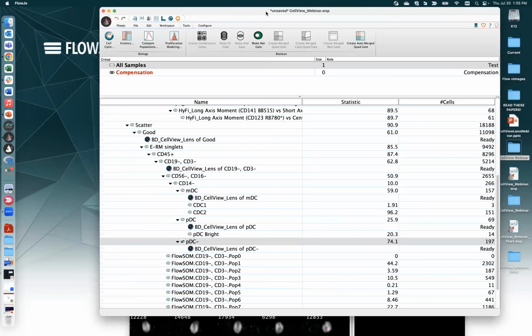All right, so that's the gist of how we anticipate the neural networks working. Again, they're working on Macs at the moment. We still have to figure out how to make the libraries work for PCs. We still have to figure out what the best neural networks are for this. We still have to benchmark which ones seem to work well in this data and which ones don't. But I just wanted to show you a little taste of where our thinking is going in terms of automating more of this process. Okay, we've got 5 minutes left. And so I would like to wrap up there and leave at least 5 minutes for questions.